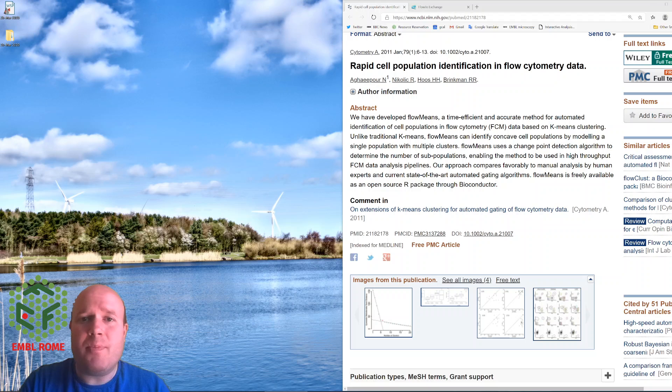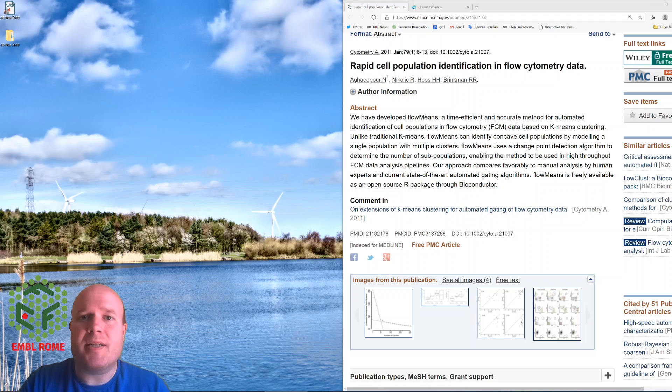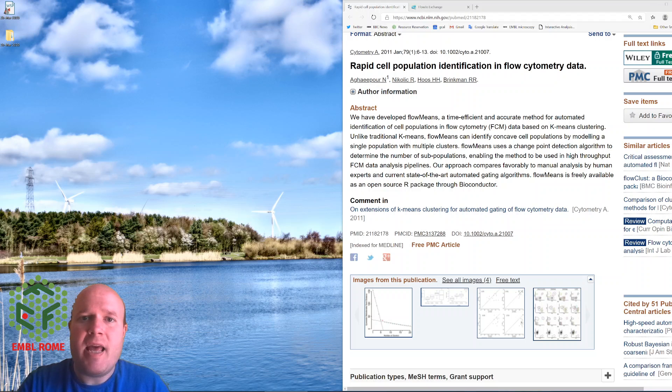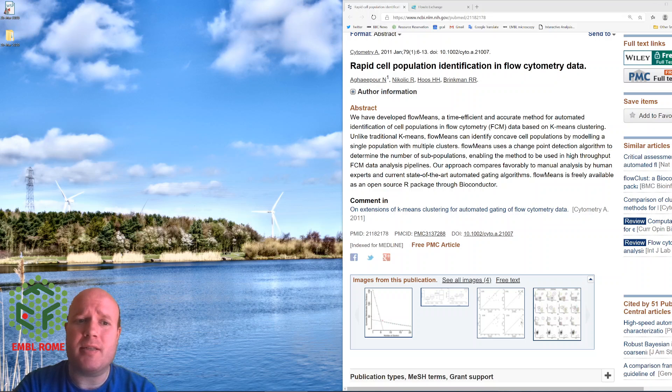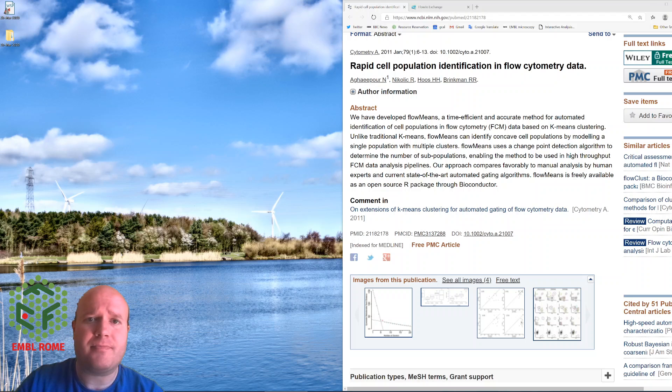FlowMeans is an R package that uses k-means clustering to identify cell populations. The plugin for FlowJo is a little bit hit and miss, but we'll go through how to use it and some of the caveats about its operation.